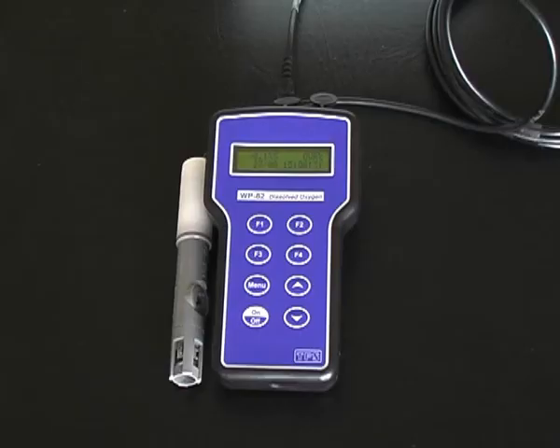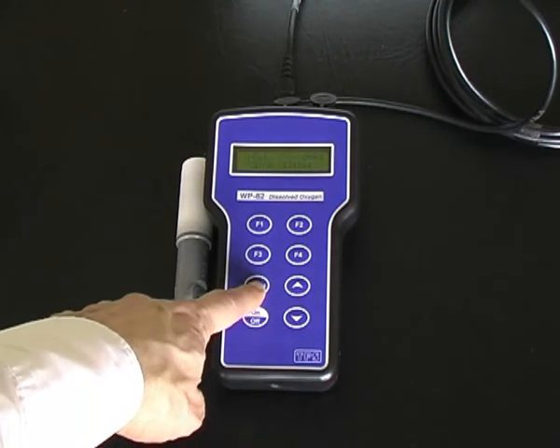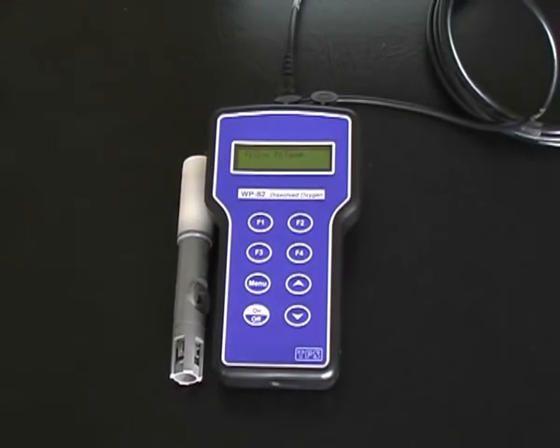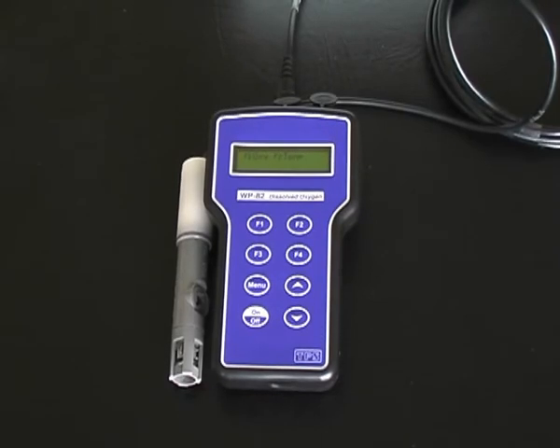To calibrate the TPSWP82Y, the procedure is the same as for the 90FLT. Press menu, press F1 for cal, and press F1 to calibrate instead of pressing enter.